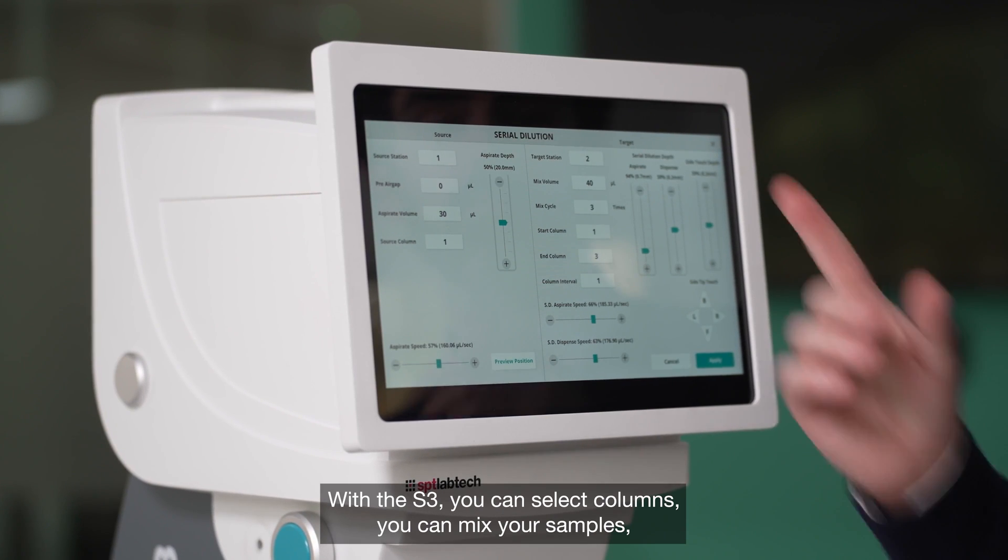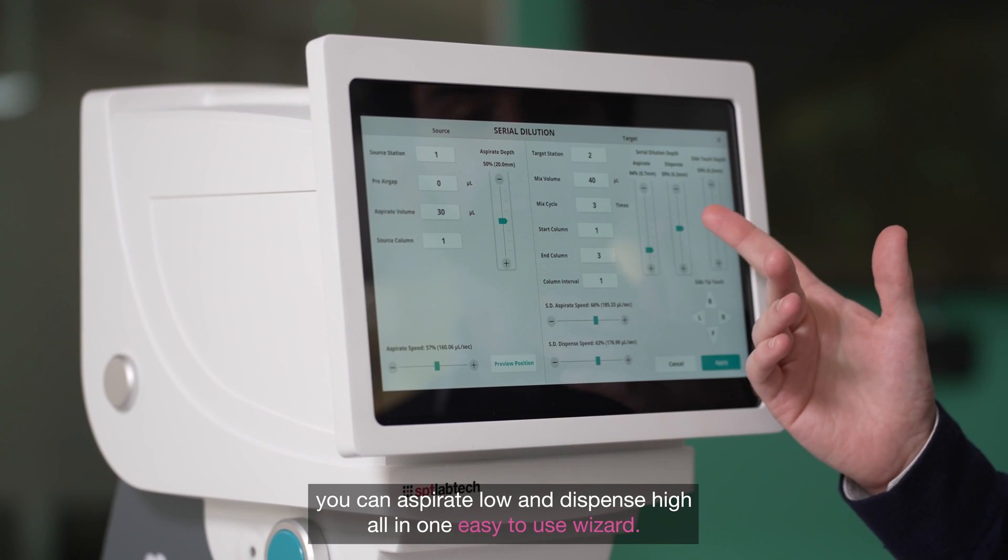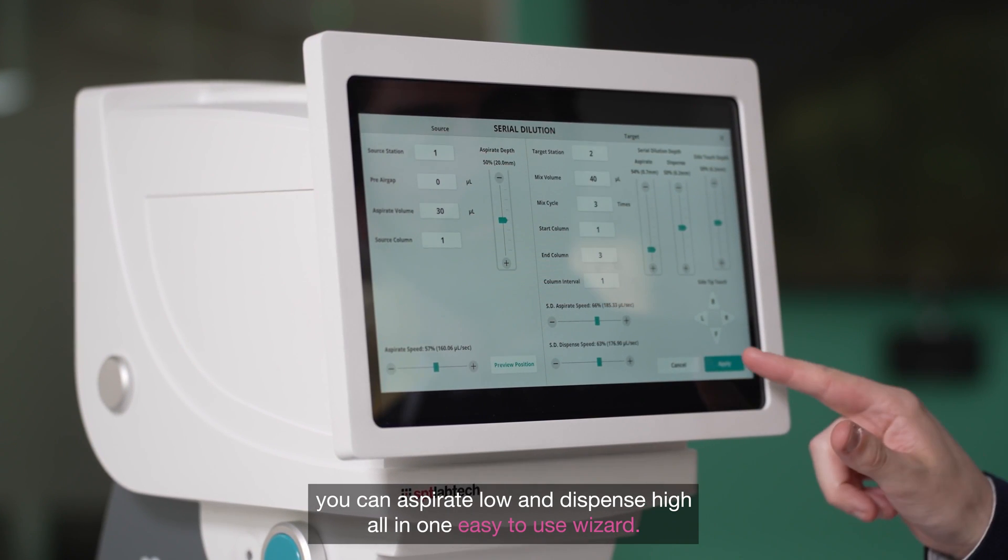With the S3, you can select columns, you can mix your samples, you can aspirate low and dispense high, all in one easy to use wizard.